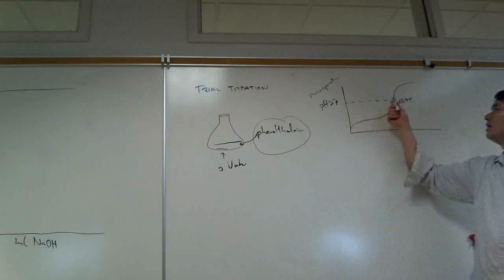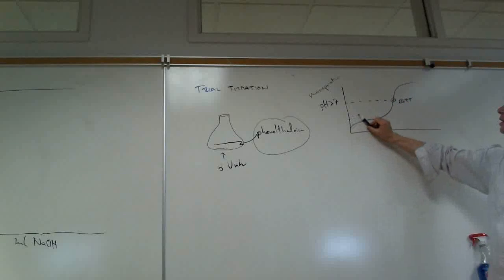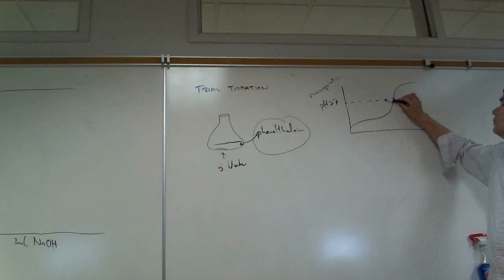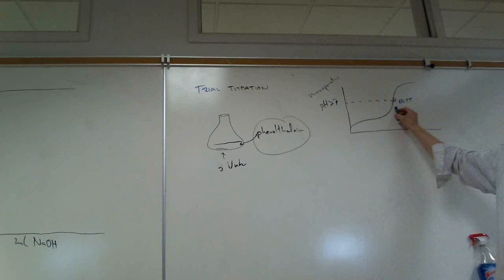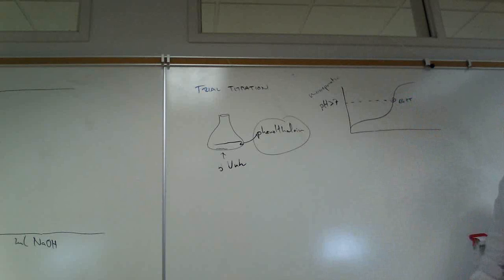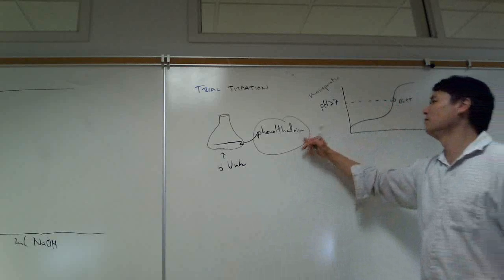So the pH is going to be greater than 7, which means that phenolphthalein is going to be colorless until we hit about here. And then it starts to turn light pink, which is good. That shouldn't lead to much error because there are very few drops from the beginning to the end of this rise. And so for monoprotic, we know where the equivalence point is roughly, based on phenolphthalein.